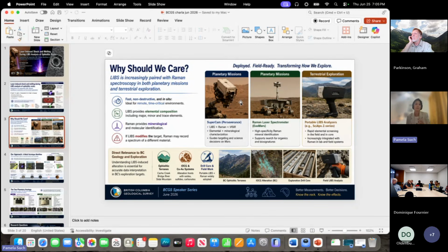For example, I work with physicists, engineers, and they say, oh, because I explained to them it's better for the geologists, we have the clean area of the sample before analysis, but we cannot do that in Mars because we are not there with our geological hammer to clean the sample. But they say, oh, we can clean it with LIBS. That was when first this question arose on my mind. Oh, wait, you're cleaning it with LIBS and then you're shooting Raman? No, that's not a good idea.